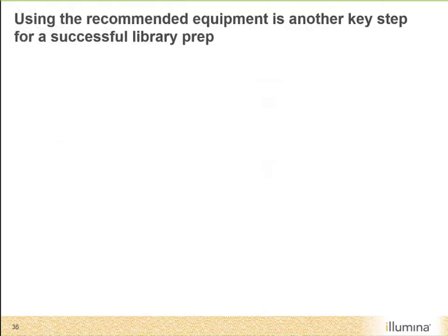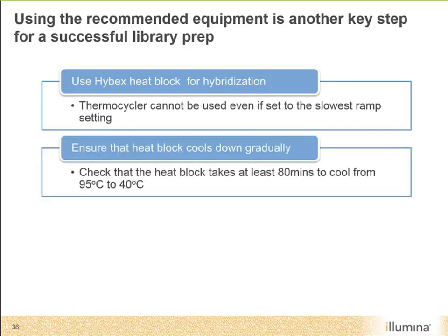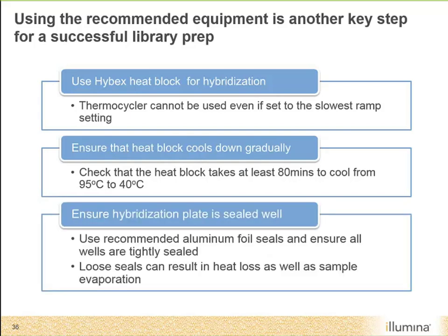Recommended equipment is also a key thing here. Using the Hybex heat block for hybridization, we have seen customers try to use a thermocycler even set to the slowest ramp setting. This can definitely impact the ability of the probes to hybridize and the efficiency of that. We want to make sure that the heat block cools down gradually. It takes at least 80 minutes to cool down from 95 degrees down to 40.